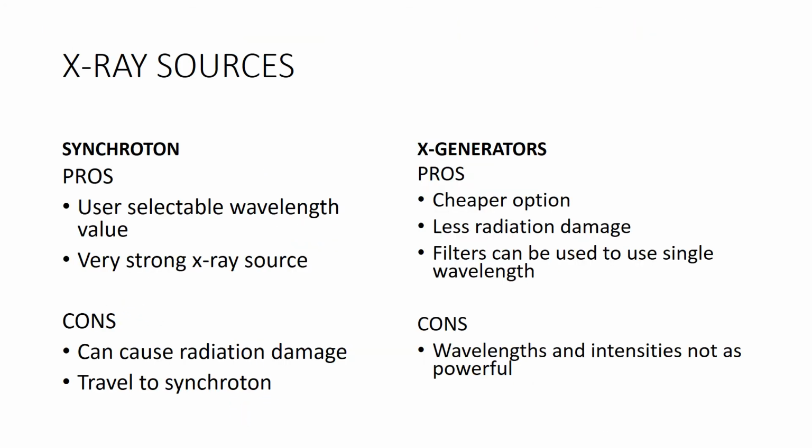There are different X-ray sources that can be used during experimentation, including synchrotrons or X-ray generators. The pros and cons of each are listed below.